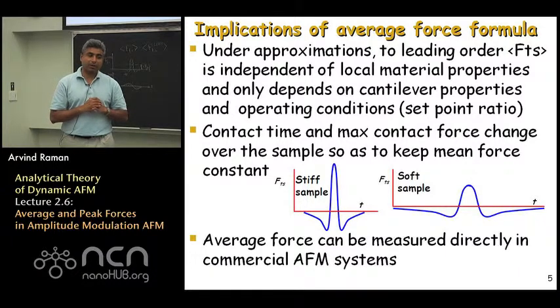So this is a very important result, and it helps us think a little bit about the relative role of interaction forces and peak forces when we're talking about different kinds of material properties. The other thing to notice from these little sketches is that the average force value is going to be typically much lesser than the peak force value. The peak force value can sometimes be even 10 times larger than the average force value.